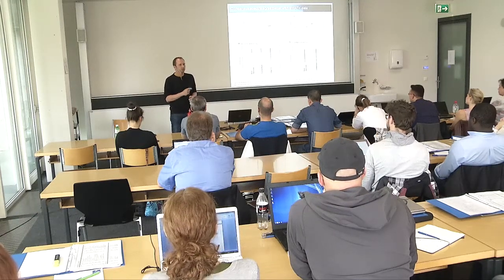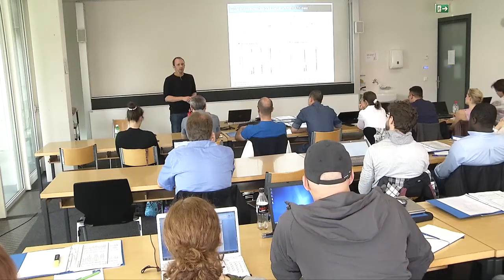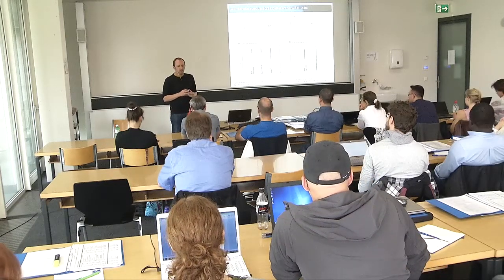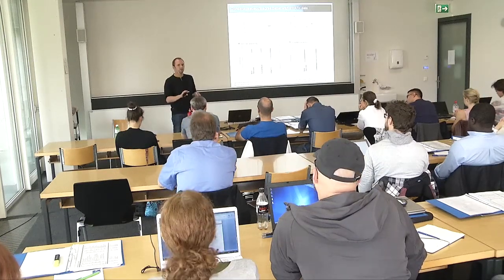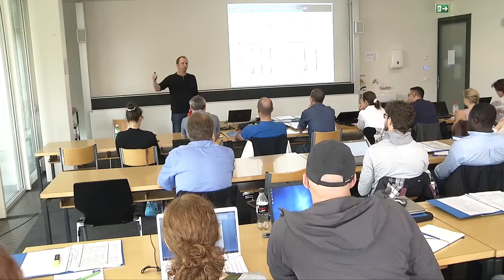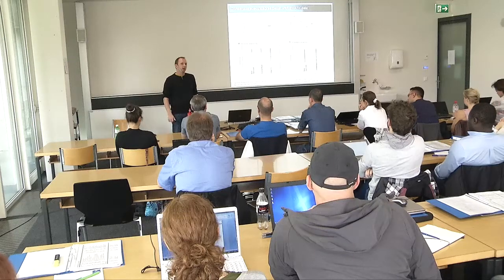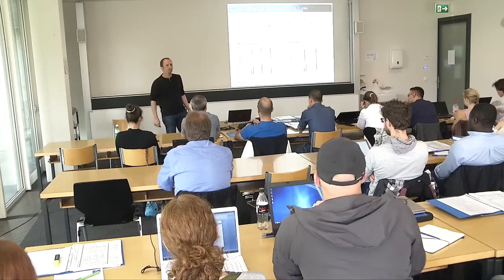And I mentioned this paper from Sam Bader in Seattle, which looked into it in a little more detail, and he found that there was an increase in the agreement between the relative fragment ions in the spectrum and SWATH as you add more spectra to the consensus. So that's half an answer, but it hasn't been evaluated systematically.